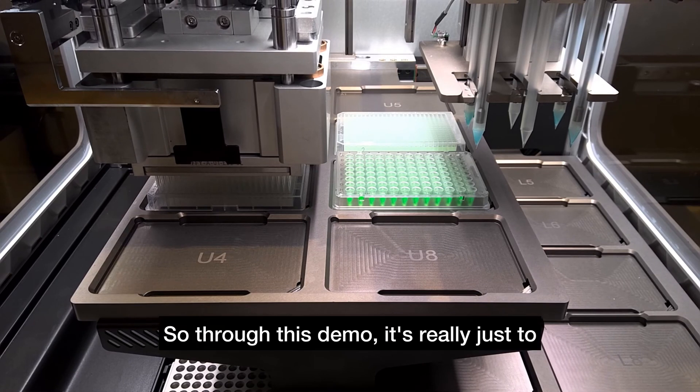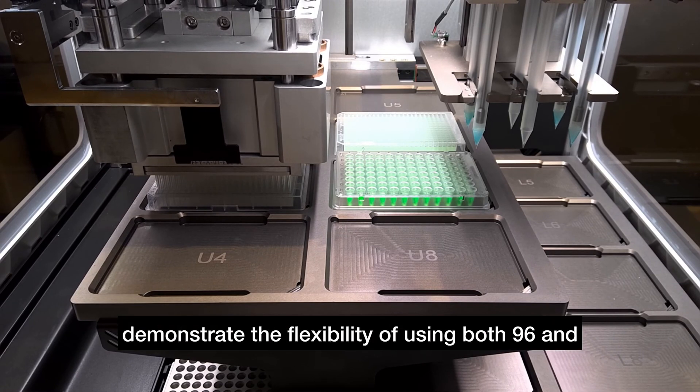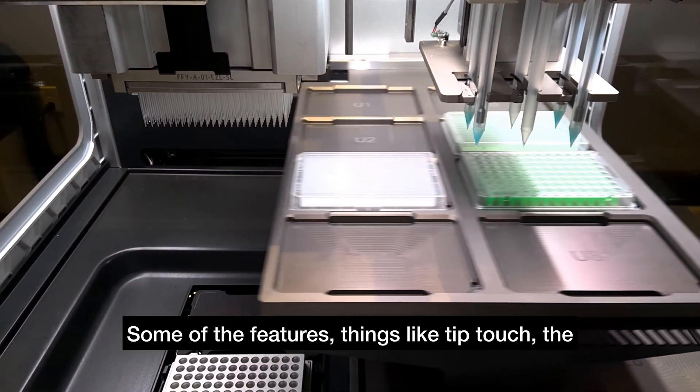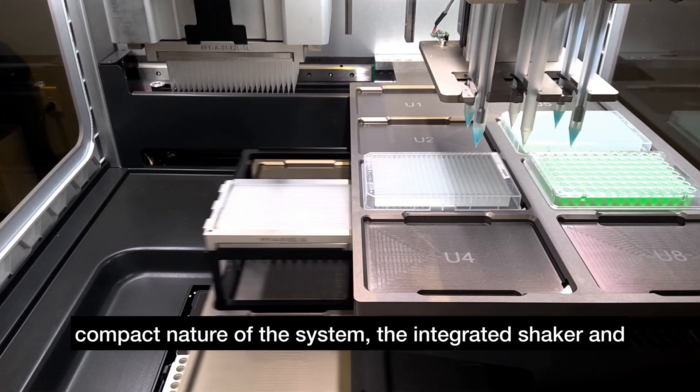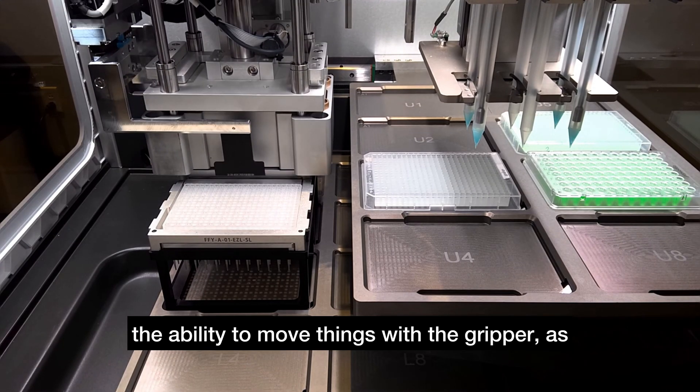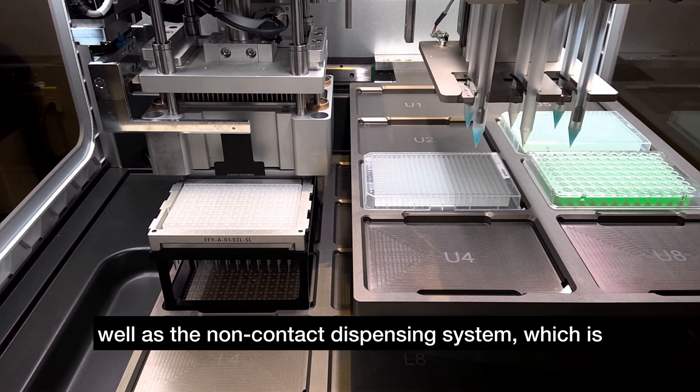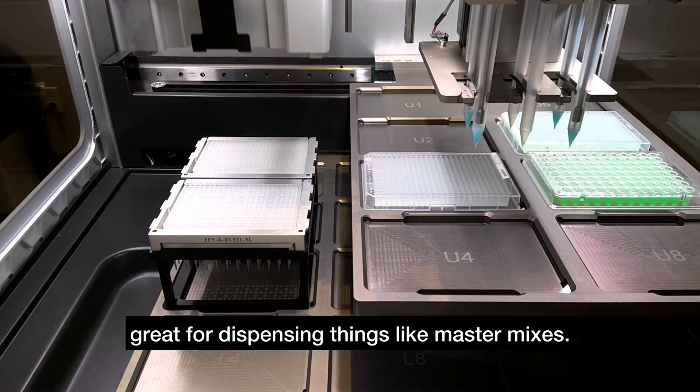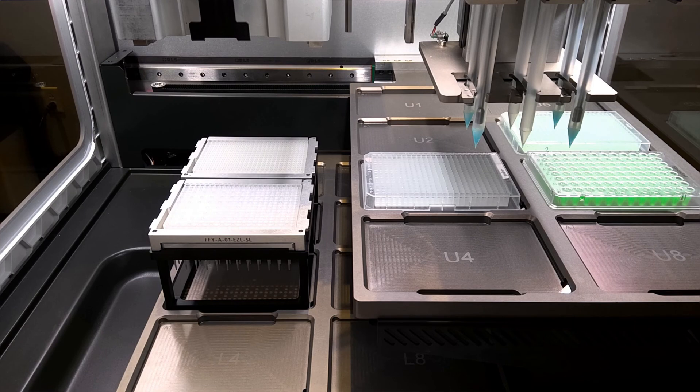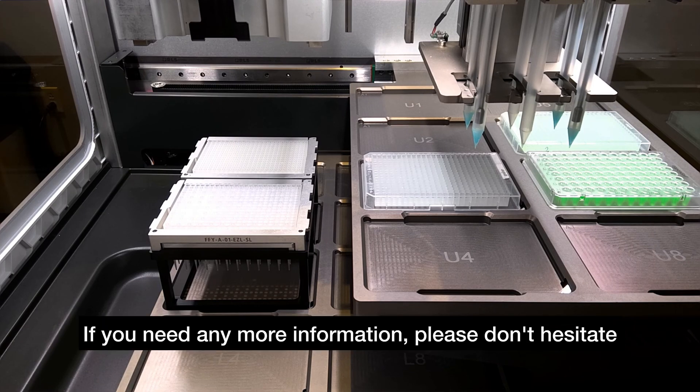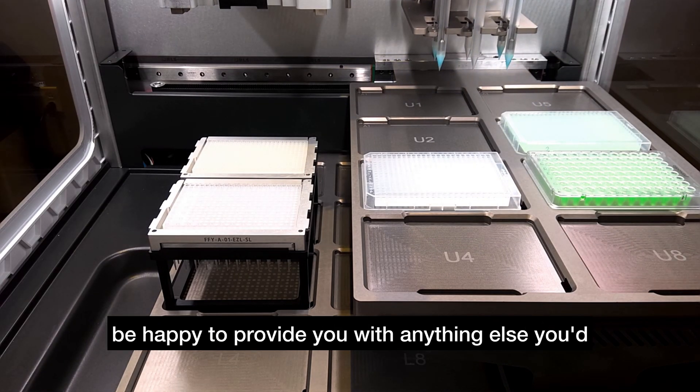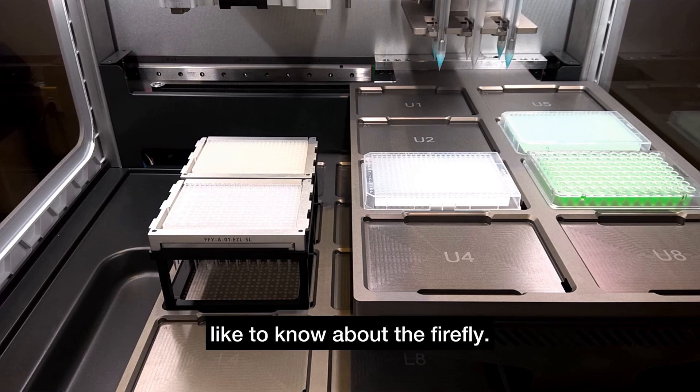Through this demo it's really to demonstrate the flexibility of using both 96 and 384 tips on the fly, seamlessly interchanging. Some of the features include things like tip touch, the compact nature of the system, the integrated shaker, and the ability to move things with the gripper, as well as the non-contact dispensing system which is great for dispensing things like master mixes. If you need any more information please don't hesitate to contact us at SPT Labtech and we'd be happy to provide you with anything else you'd like to know about the Firefly.